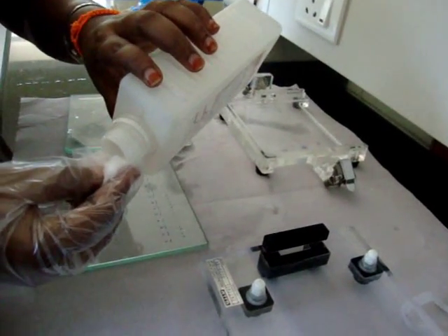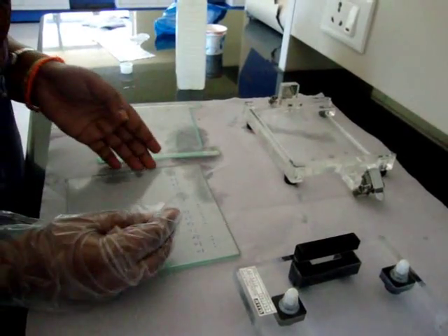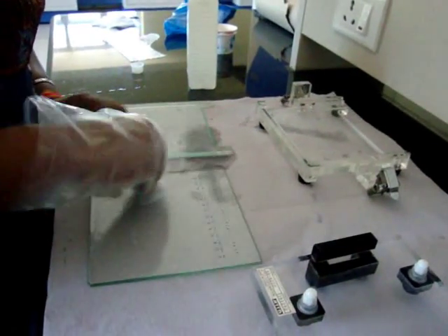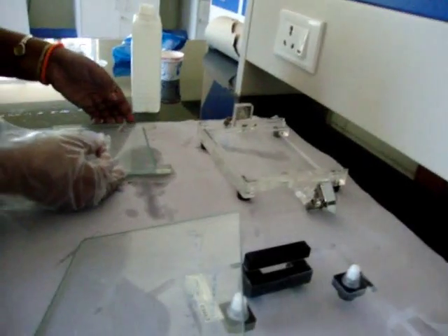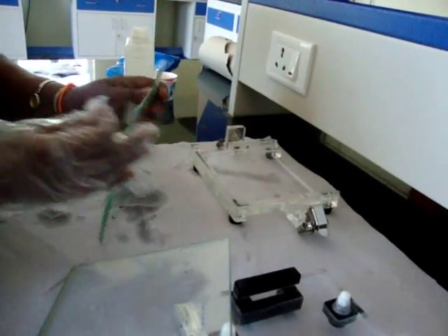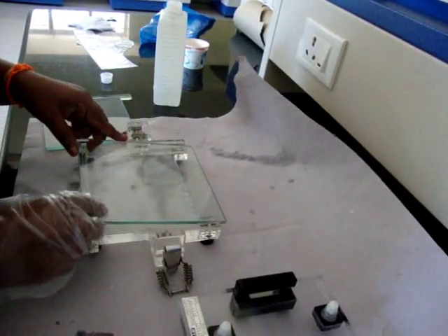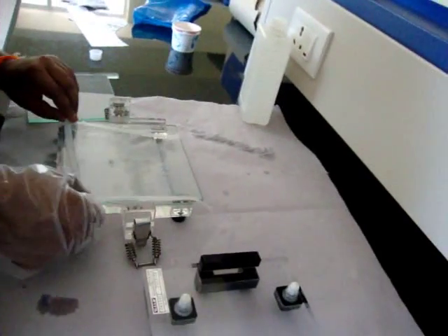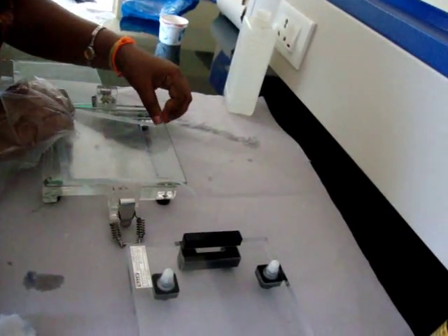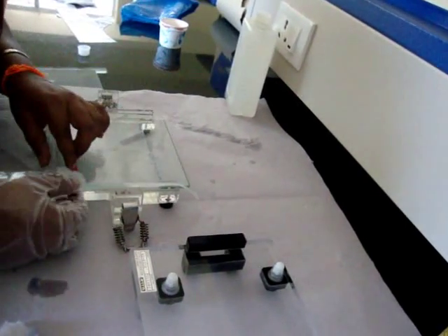Then, casting the gel. Wash the glass plates thoroughly with water followed by ethanol solution. Spacers are placed in between the plates.